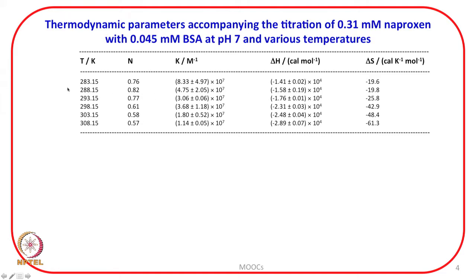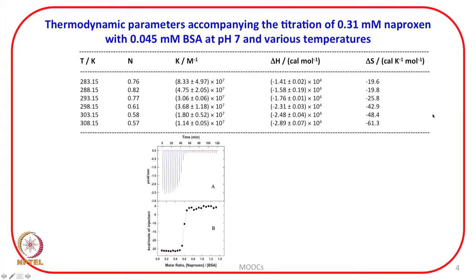When you look at the data obtained by use of isothermal titration calorimetry, the isothermal titration calorimetric profile is shown in the following figure.